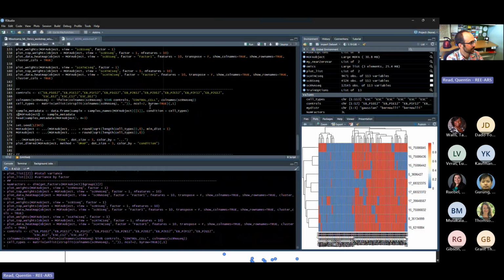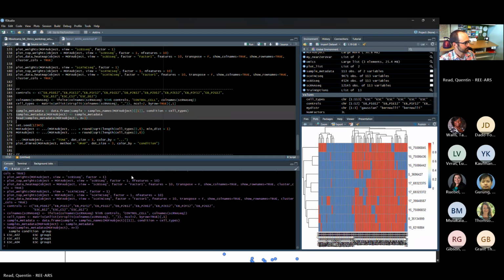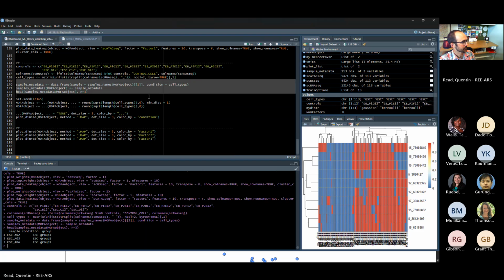So this is called samples underscore metadata, the function that we use to access or change the metadata of a pre-fitted object. So we'll run these 3 lines to do that. So yes, it's telling us this sample comes from an embryonic stem cell and so forth. Everyone good? Yeah, we're about done with this first demo here.